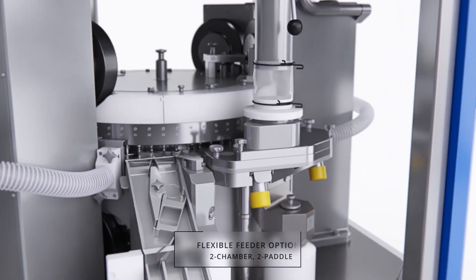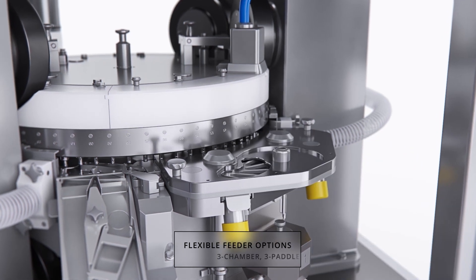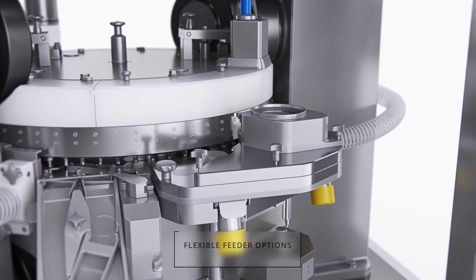To adapt to and optimize the flow properties of the material, the XT600 features a flexible 2-chamber or 3-chamber variable speed feeder, driven and controlled by a servo motor.